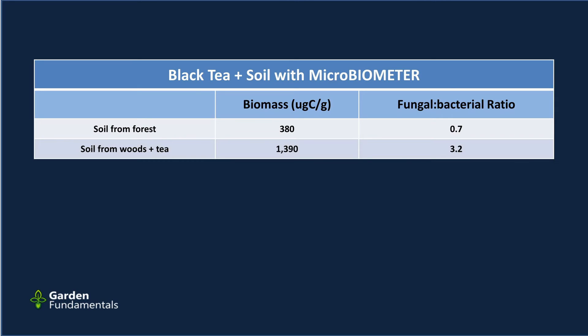I ran one more test to examine this coloration effect. I took a soil sample and processed it through the normal test using clear water, then took that same soil and ran a second test but added tea instead of water. The soil-only sample gave a value of 380 with a fungal-to-bacterial ratio of 0.7. The soil-plus-tea sample gave a value of 1390 with a ratio of 3.2. The tea made both values go much higher — the number you get depends very much on how colored the solution becomes.